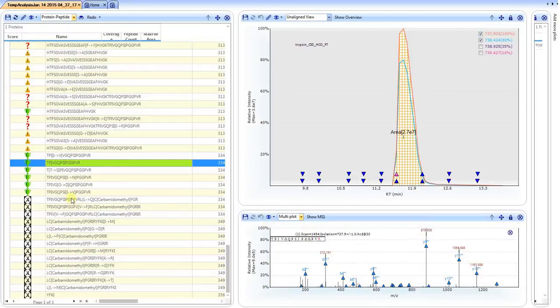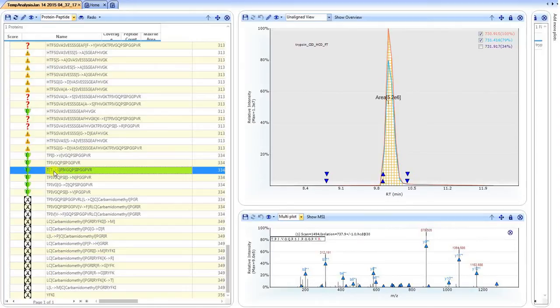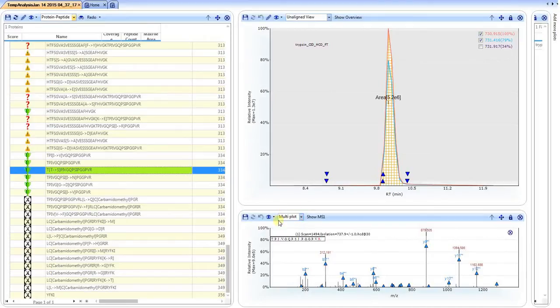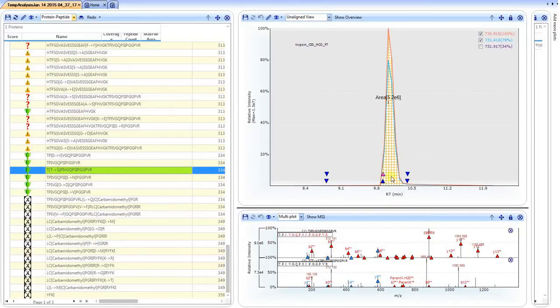First of all, we click on the second option here, where the threonine is switched to the serine, and we are going to show the multiplot. We click on one of the up triangles for the same charge state, and we begin to look at the now comparative product ion spectrum.